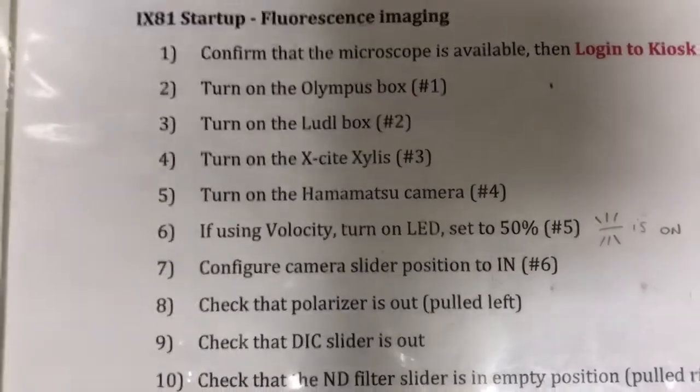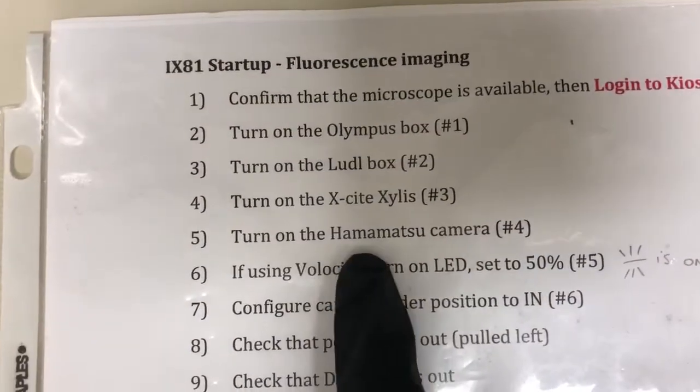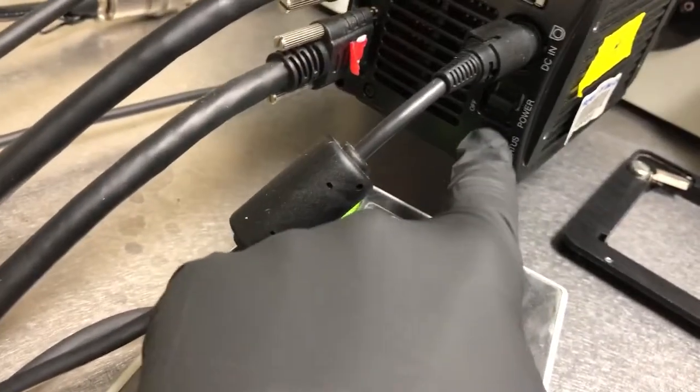If you're using velocity, excuse me, I skipped a step. Next is to turn on the Hamamatsu camera. That's number four. So the camera is here and we turn it on at the back. There's the power switch. You'll see a light turns on.